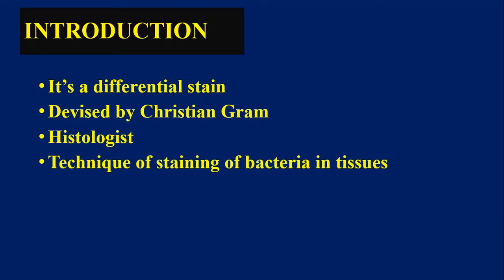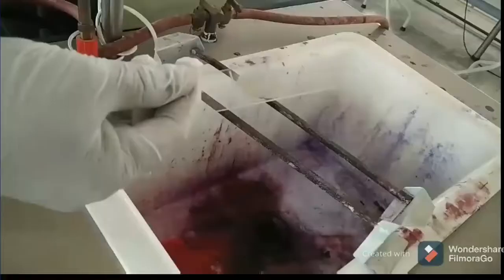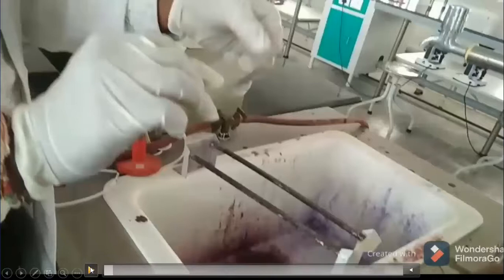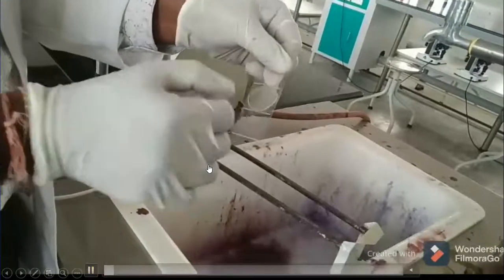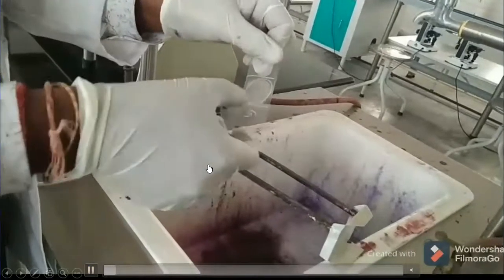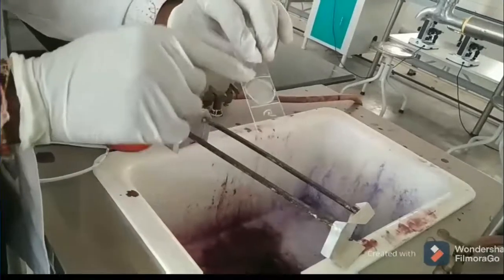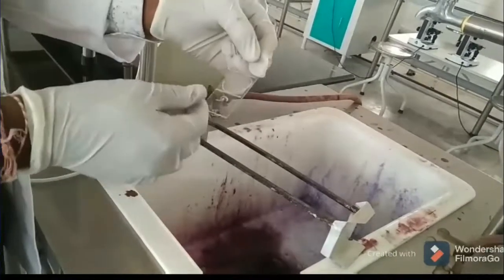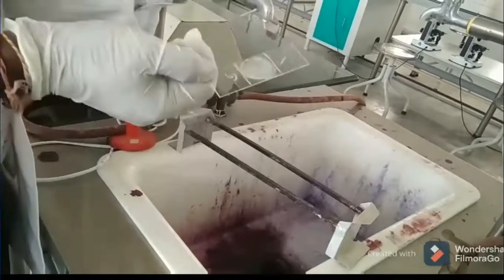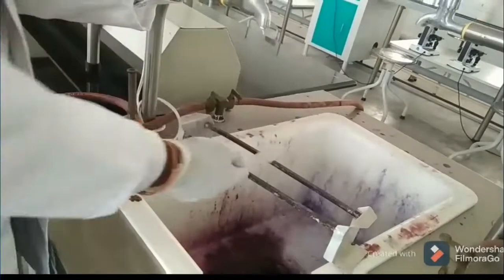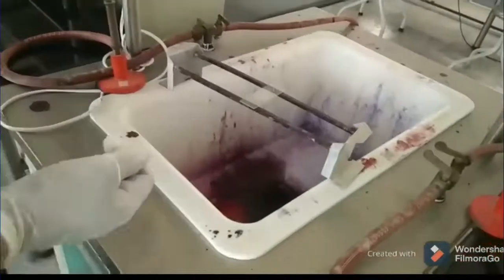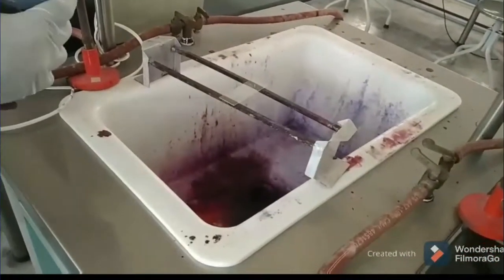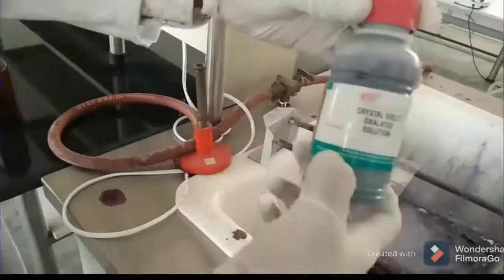The procedure for gram staining begins with a smeared slide. We take the smeared slide and mark it with a marking pencil. The marking should be on the opposite side from the smear.